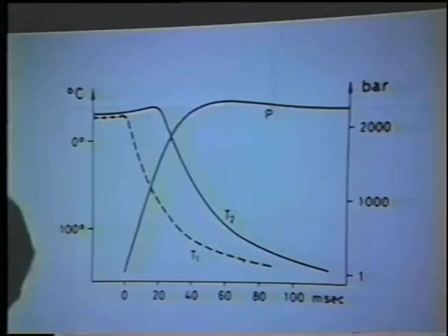And during the years of its development, it looked as though we were going to have to be satisfied with not quite optimal freezing that was, say, fair to good. Since we've made the various improvements, the quality of freezing has improved and is now very good to excellent in many cases. So it looks as though this may actually be a viable technique for doing really high-resolution studies in biological systems.